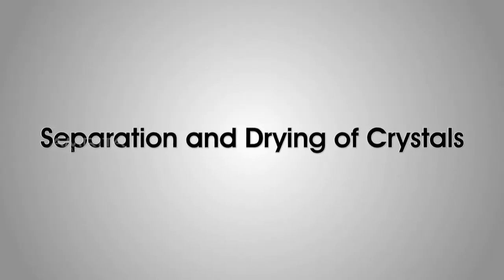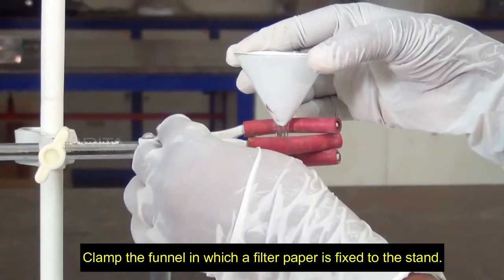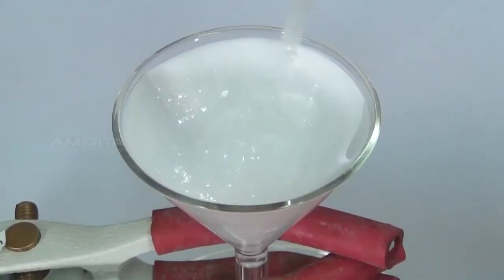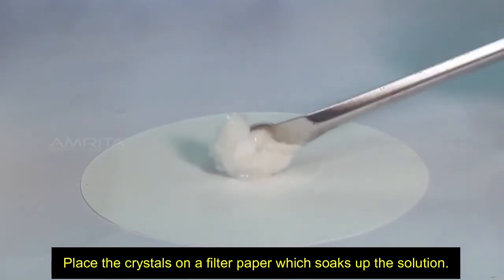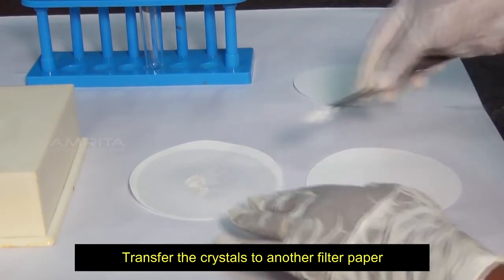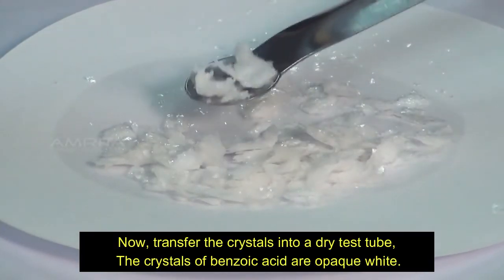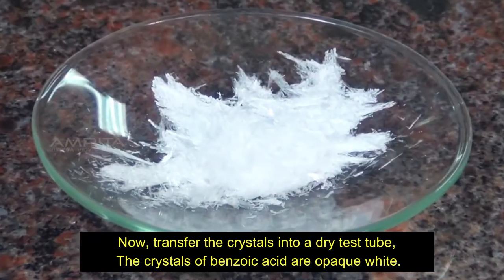Separation and drying of crystals. Clamp the funnel in which a filter paper is fixed to the stand. Place a beaker under the funnel and separate the crystals by filtration. Wash the crystals with cold water. Place the crystals on a filter paper which soaks up the solution. Transfer the crystals to another filter paper and dry them by pressing gently between the folds of the filter paper. Now transfer the crystals into a dry test tube. The crystals of benzoic acid are opaque white.